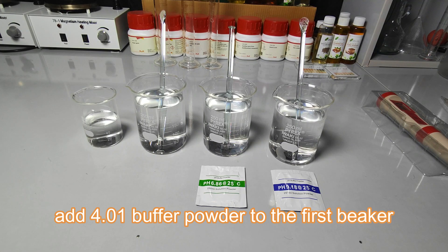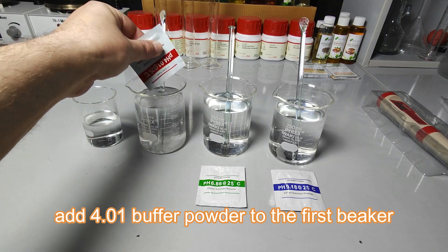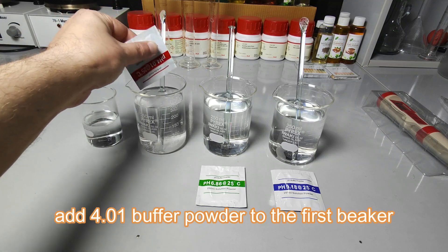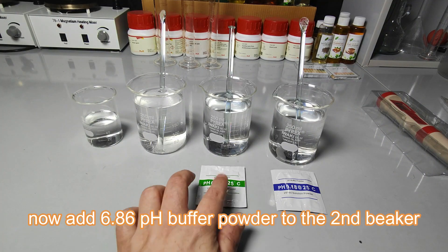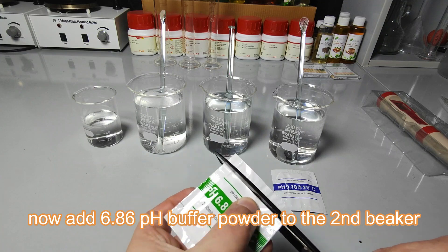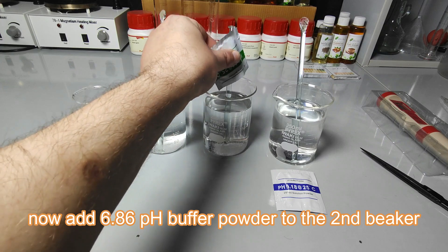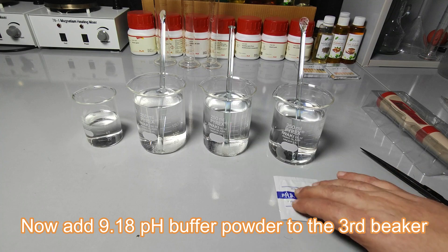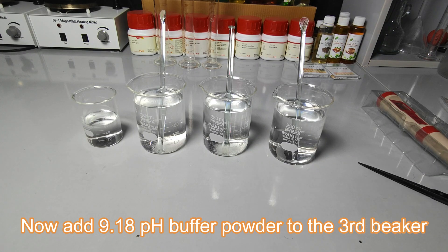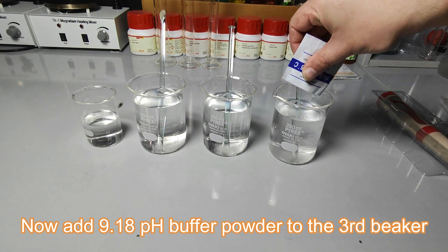First, put 4.01 pH buffer powder in 250 ml distilled water and stir with a glass stirring rod until powder completely dissolves in the water. Then put 6.86 pH buffer powder in 250 ml distilled water and stir with a glass rod until fully dissolved. After that, put 9.18 pH buffer powder in 250 ml distilled water and stir with a glass rod until fully dissolved.